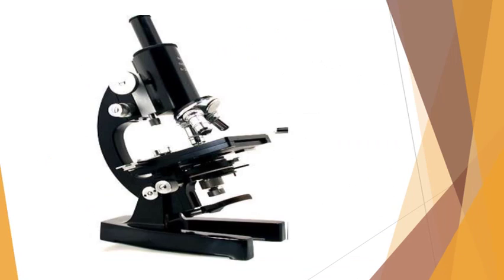So here in this slide I indicated to you the illuminating parts of the microscope. So here we have a mirror, or illuminator.